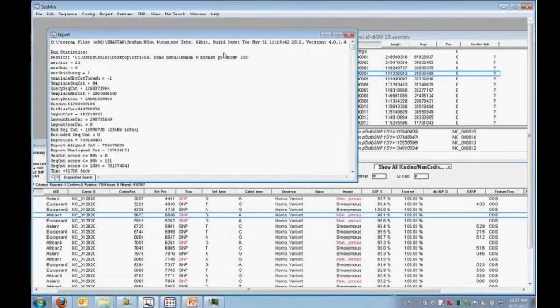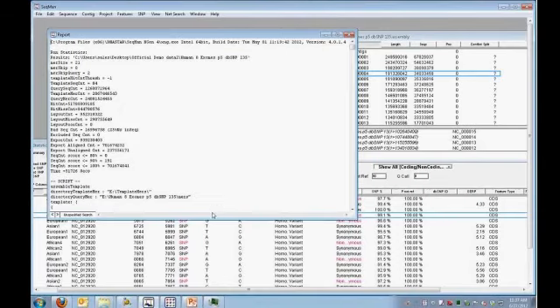The report file, I won't go through all the details here, but the report file gives me some of the metrics on the alignment. So again, this is a piece of information that we might use for troubleshooting. I can see how many sequences missed the template, had at least one MER hit, and I can also see how many bad sequences there were, and then how many sequences actually exported out, and I'll just highlight that, to the BAM file. And this is about 701 million sequences were exported to the BAM format.